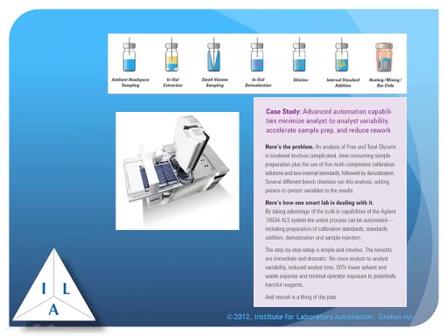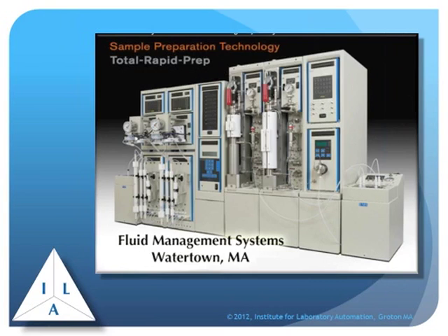You can do in a very small footprint work that may have taken a 4x8 foot space using something like a Zymark system or one of the other early robotic systems. So here you have a fixed piece of hardware that has a lot of capabilities. It simply needs to be programmed to do what it needs to do. And if you change the analysis, change the programming, the same piece of hardware works. So robotics is advancing.